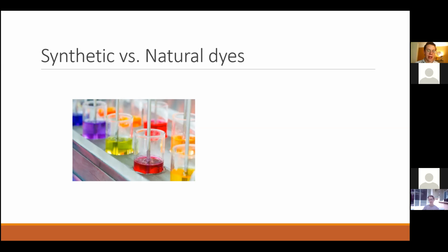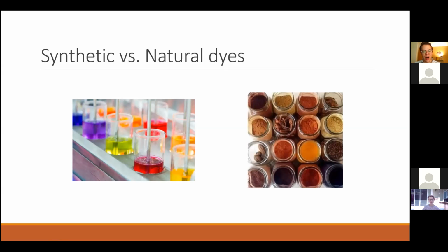They have pretty decent results, and you can just make the dye and then use it. There's no need to do a whole complicated extraction, which is why natural dyes, that's their drawback. So the major leg up that natural dyes have over synthetic dyes is they are very sustainable.